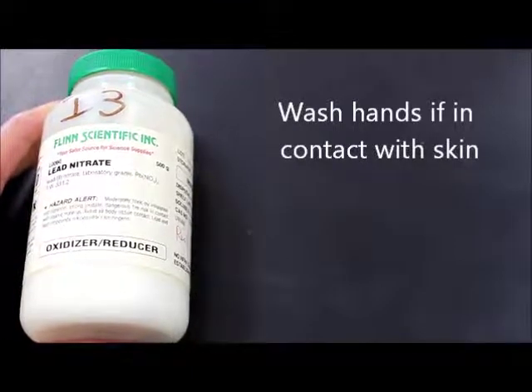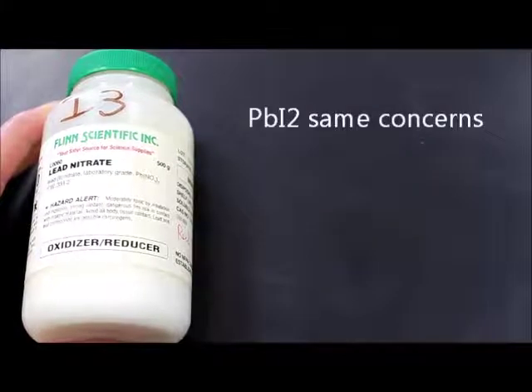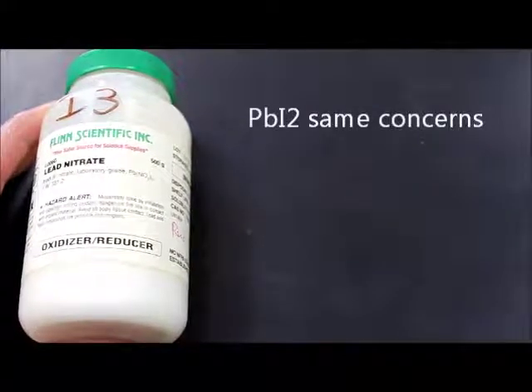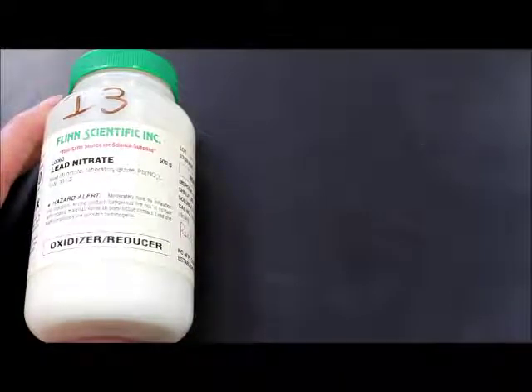Now, just a quick note, our product, lead 2 iodide, is also a lead-containing compound. All the same things apply to that. So that yellow substance we're going to produce, we're going to want to stay away from that just the same way we're going to want to stay away from the lead 2 nitrate.